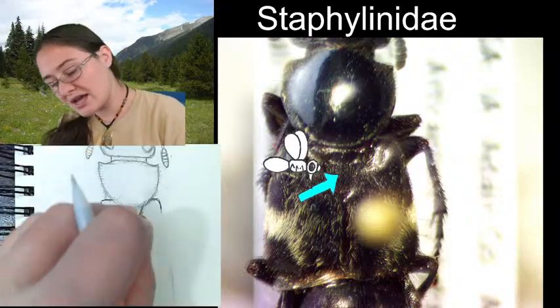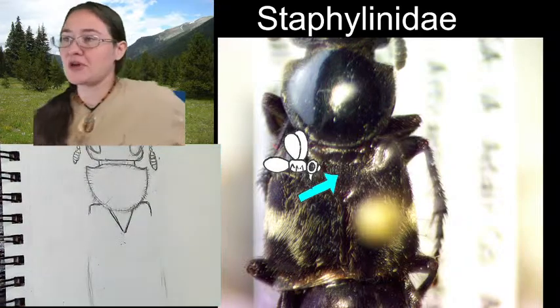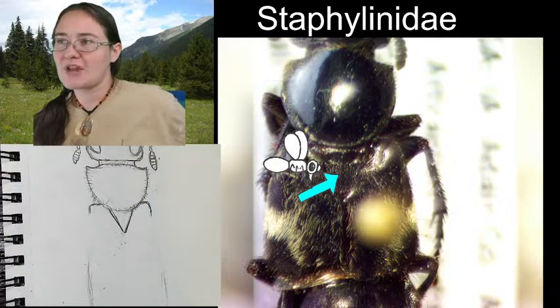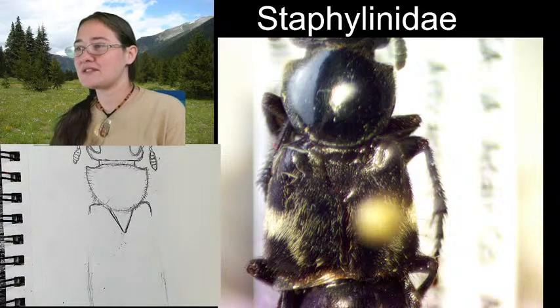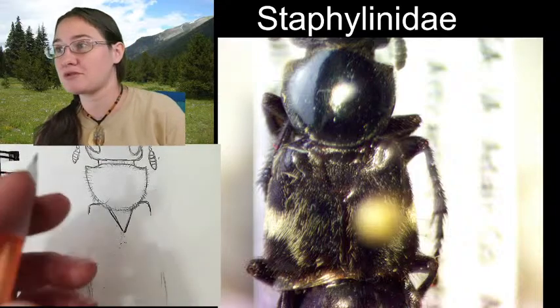It sits between the elytra. I just like to point it out because it's one of those main characteristics we see on pretty much every beetle and fly, and we see them prominent on cockroaches and many, many insects. So they're worth being able to point out and notice, especially when we're looking at insects under microscopes.